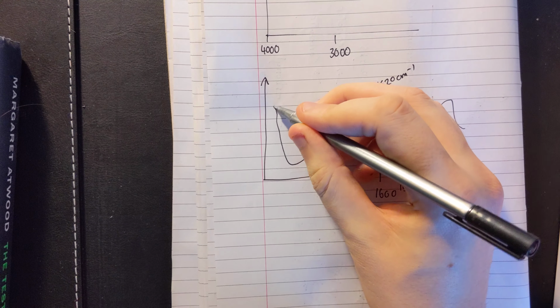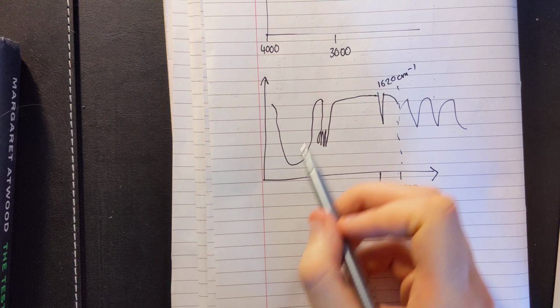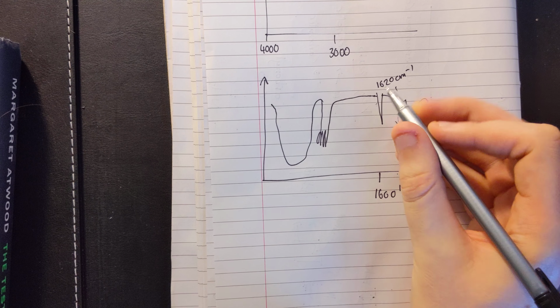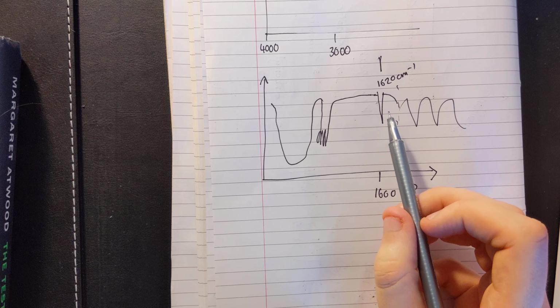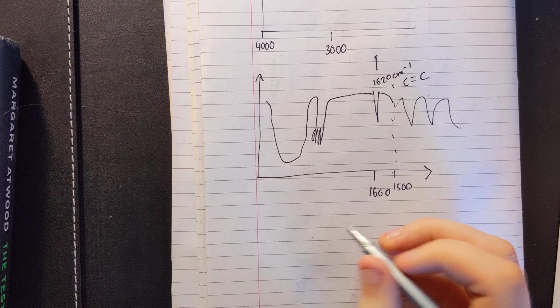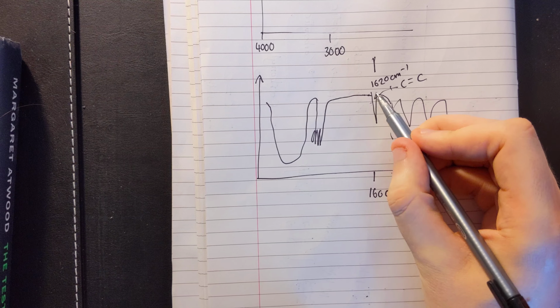Let's say we've got an alcohol group as well. So you might overlook it because we've got this big old peak here from the alcohol OH, and this little one, it can be even smaller sometimes, maybe only down to around here, so just a little tiny peak like that. So look out for it, be one of the things you're looking for. So spot that, that's going to be the CC double bond.